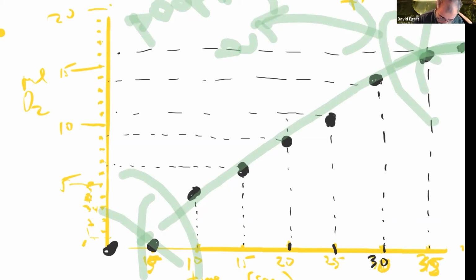So look, I'm going to take a ruler, and please use a ruler. Sometimes people don't, but you're going to actually calculate stuff on here. So please use an actual ruler, and you're going to draw your best fit line. Best fit line doesn't mean it goes through everything. It means you are eyeballing what you think is most likely. So I'm going to say that.